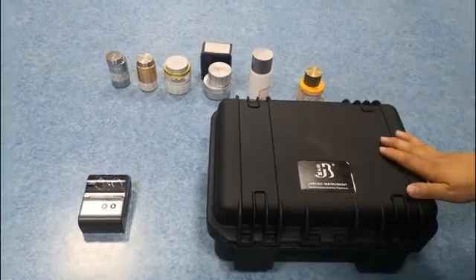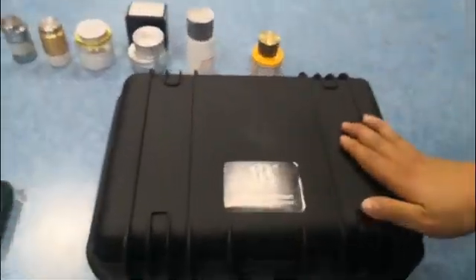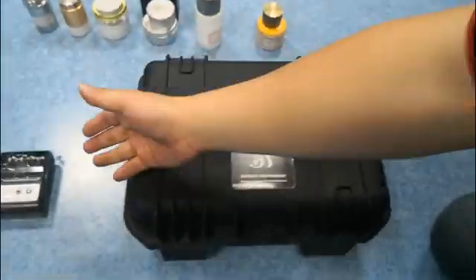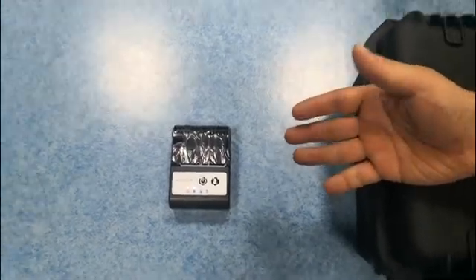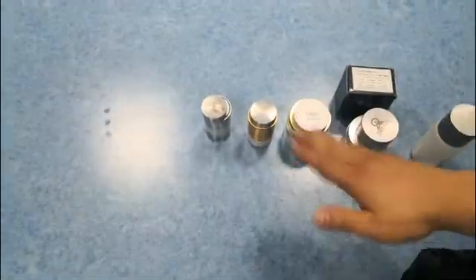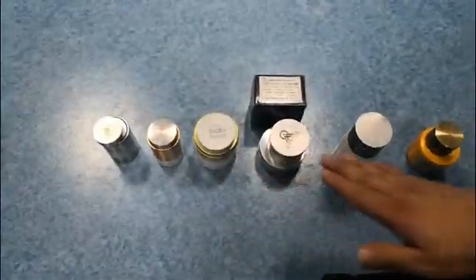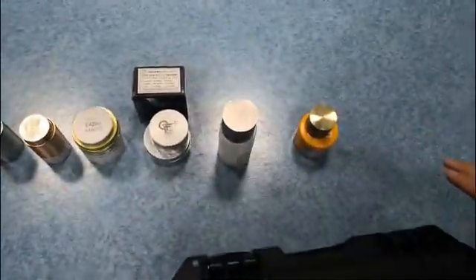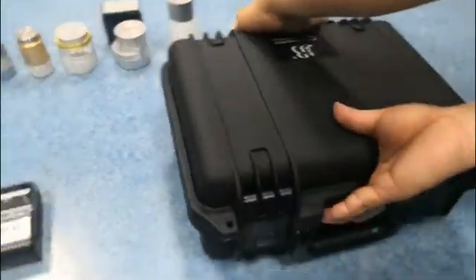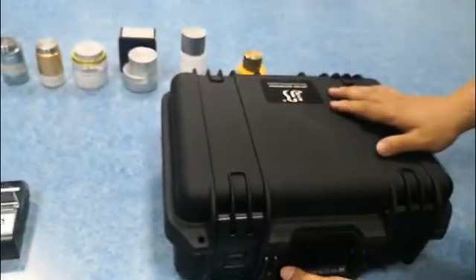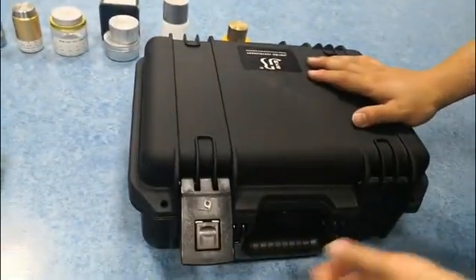This is our laser metal analyzer. This is a printer. These are the metal samples we will test today. Now we open the box.